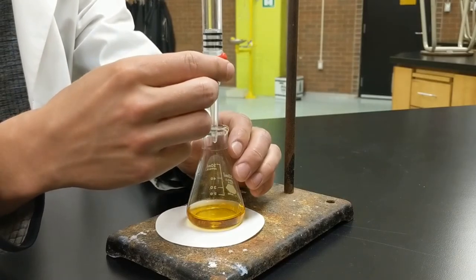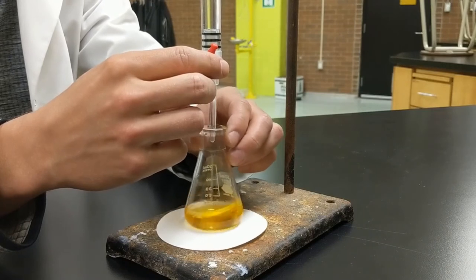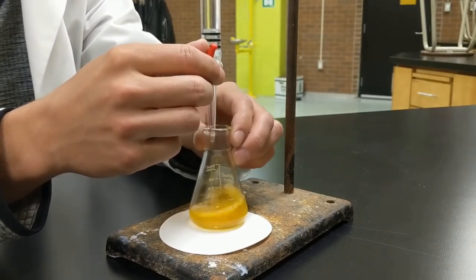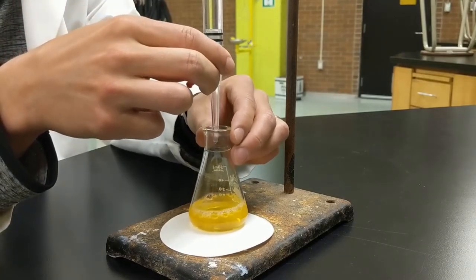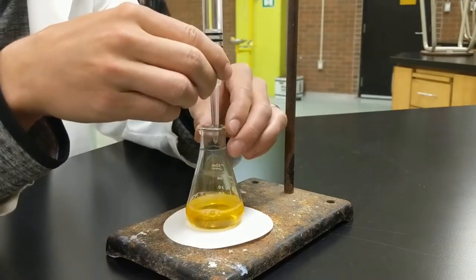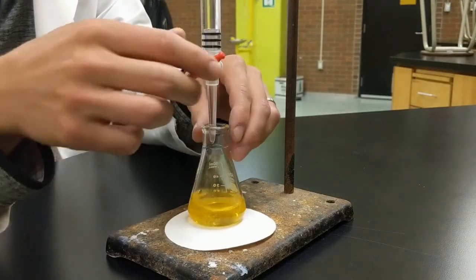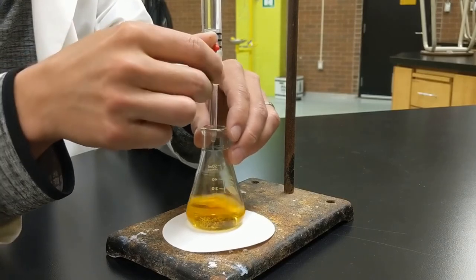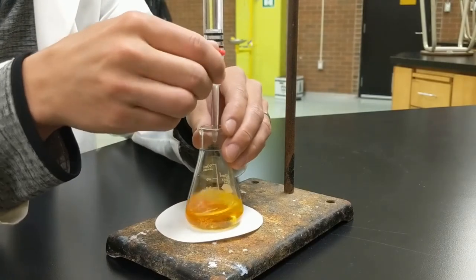Here we go with trial number two. I haven't learned from my mistakes entirely — I'm letting a lot out — but I have a better idea of how much I need now. Last time I used just under 15 milliliters, so I want to use even less this time. As I watch the readings on my burette I know I'm getting closer to the end point, so I'm starting to slow down.